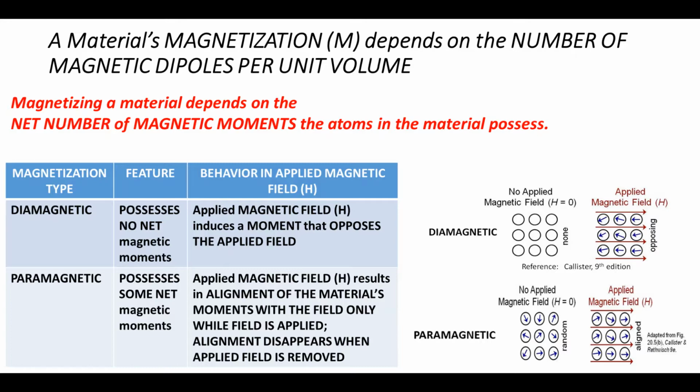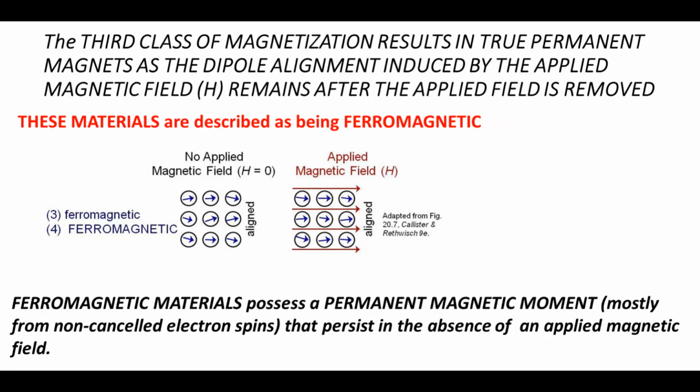Above the Curie temperature, the atoms are excited and the spin orientations become randomized, but they can be realigned by an applied field. The material becomes paramagnetic. Below the Curie temperature, the intrinsic structure has undergone a phase transition. The atoms are ordered and the material is ferromagnetic. The paramagnetic material's induced magnetic fields are very weak compared with ferromagnetic materials' magnetic fields.